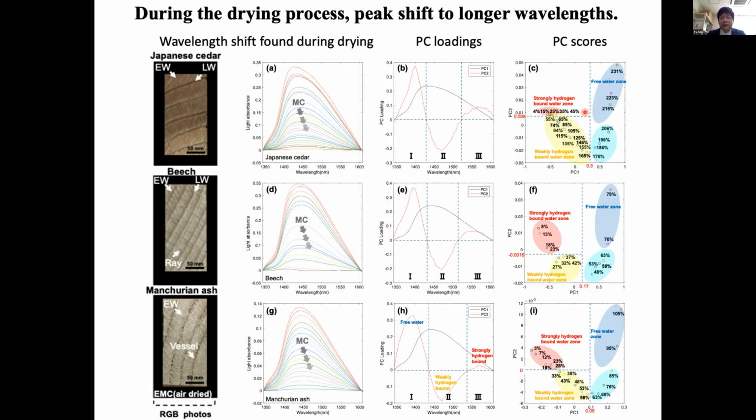It is evident that the first PC score decreased from right to left during the wood drying, while the second PC score fluctuates up and down. It shows that the water in wood could have at least two types. Combined with the existing knowledge about wood drying, the water was classified into free water, weakly bound water, and strongly bound water.